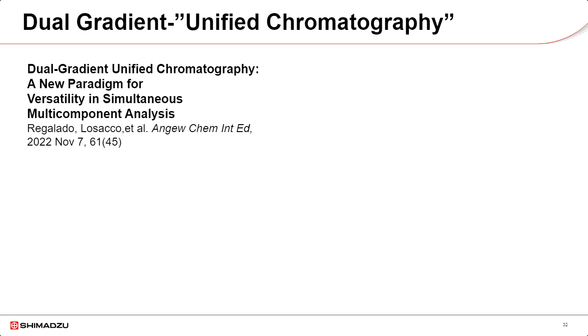So up to this point, we've talked almost exclusively about small molecules, whether they're chiral or achiral, but we really haven't talked about larger molecules. And that's for a reason, because this is kind of a new area in SFC technology. So there have been some really great advances right now in enhanced fluidity, unified chromatography, and so forth.